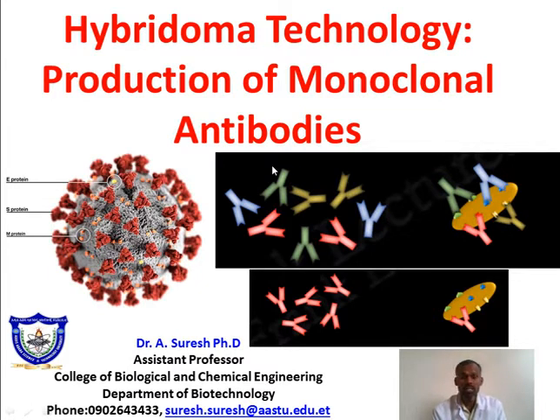These days the novel coronavirus 2 is spreading all over the world and causing COVID-19, a pandemic disease. There's no medicine for that. How about this technology, hybridoma technology, for producing monoclonal antibodies for the disease? In this technology, there are a lot of steps. I will explain one by one.